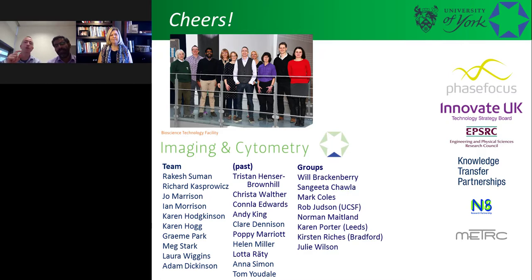But critically, it does drift in many other platforms for fluorescence microscopy and stuff. So with the QPI, at least we can do that over time without it drifting. That's been a big advantage. Dyson, that movie at the start, when you saw Dyson, that was just a clip out of a 5-day time lapse itself. So great question. Thank you very much.